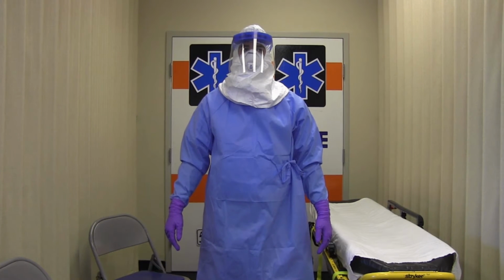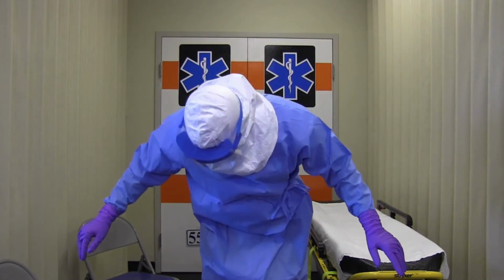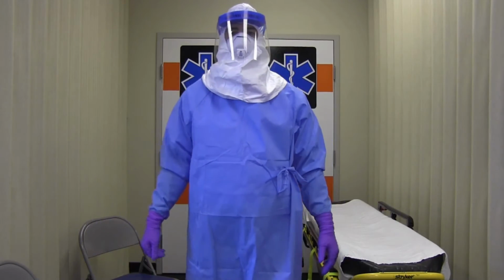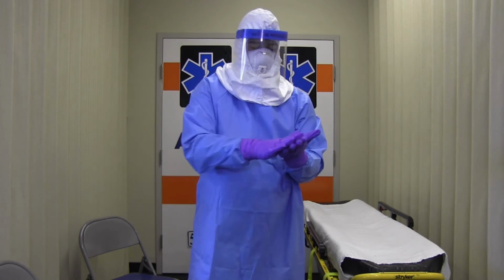The first step in doffing PPE is to inspect the PPE and assess for visible contamination, cuts, or tears before starting to remove. If any PPE is visibly contaminated, then disinfect using an EPA-registered disinfectant wipe. Next, you will disinfect your outer gloves with an alcohol-based hand rub.